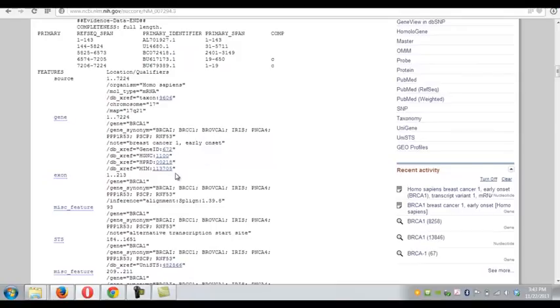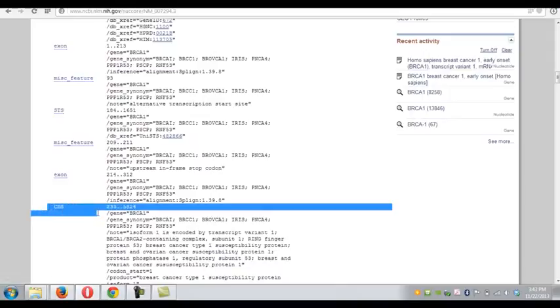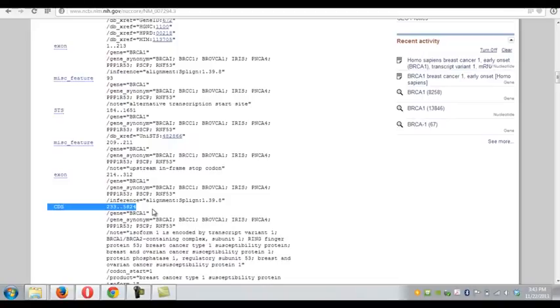You see some links to some other databases, and I'll show you some further links shortly. It lists a few of the exons. Exon 1 goes from position 1 to 213. Exon 2 goes from 214 to 312. Most importantly is the CDS region, and CDS is a quite unusual abbreviation. It stands for the coding region of a protein, beginning with the start codon and including the stop codons. And stop codon, even though it doesn't code for an amino acid, is considered part of the coding region of the protein by definition. And you may wonder how coding region becomes CDS. Well, coding sequence. Like I said, it's strange.